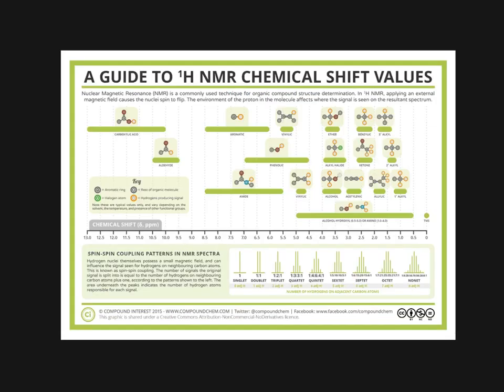Now we are going to go on to proton NMR. This is a chemical shift guide to show possible functional groups in different areas along proton NMR charts.